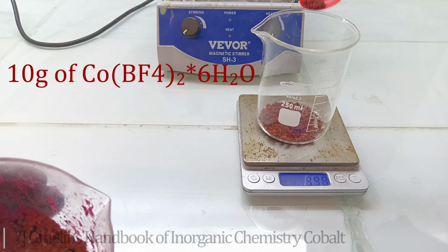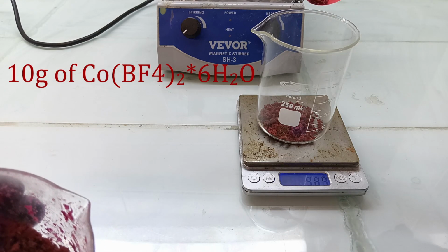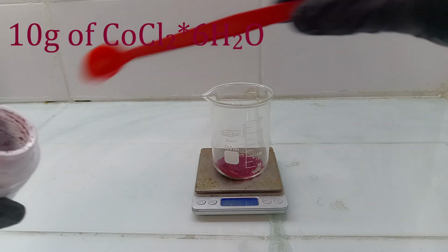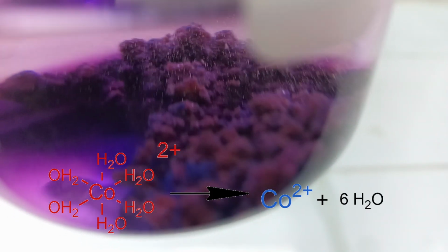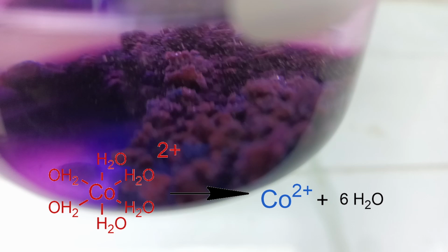For the first complex, I measured out 10 grams of Cobalt Tetrafluoroborate hexahydrate. And for the second, 10 grams of Cobalt Chloride hexahydrate. I dissolved both of them in anhydrous ethanol, and while dissolving, the cobalt loses 6 molecules of water and turns into this nice deep blue.